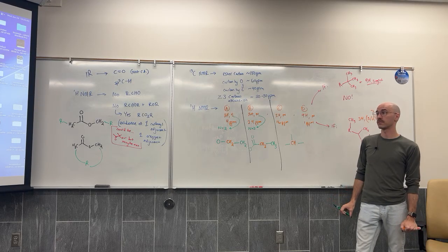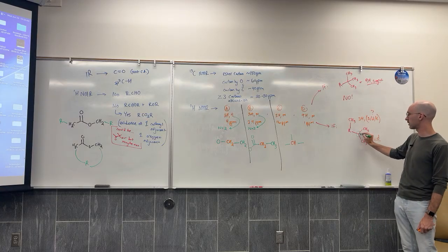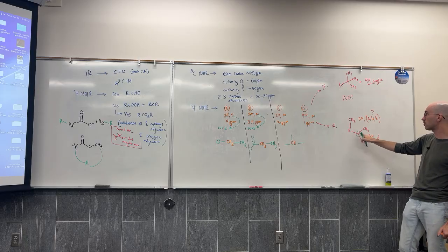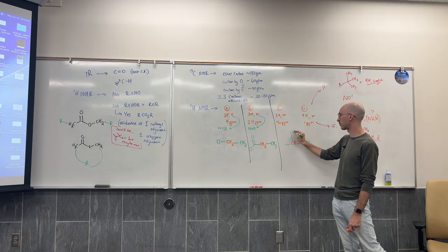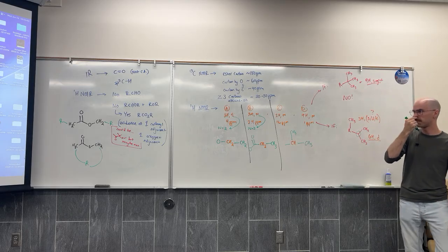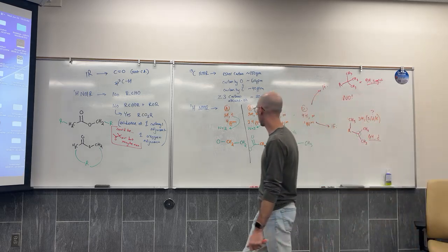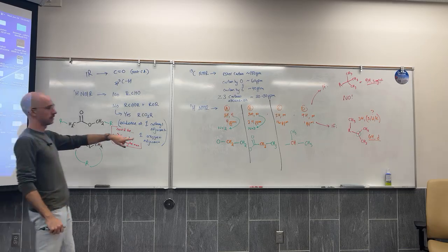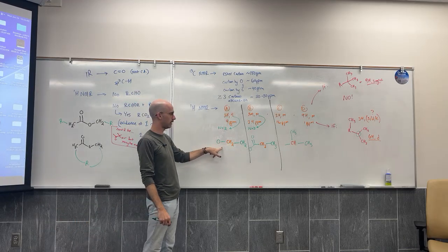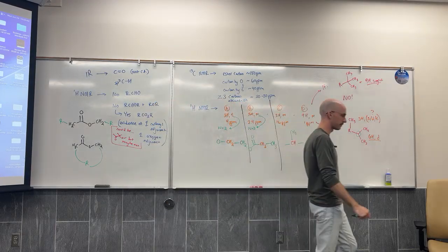What are they? Good question. We've still got a lot of 3 H's. Hey, actually, we were just talking about having a CH that had 2 methyl groups. So maybe this is bonded to 2 of our methyl groups. The other thing that could be attached is this chain. This group could be connected still.